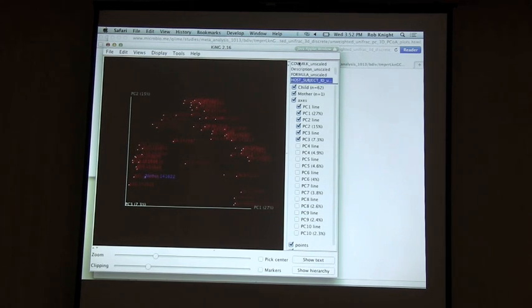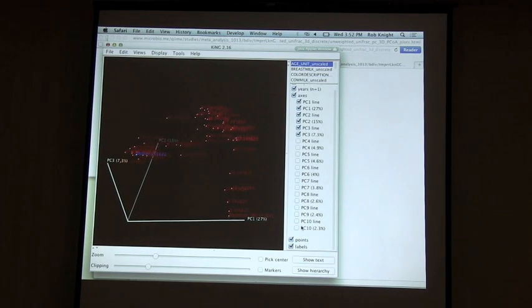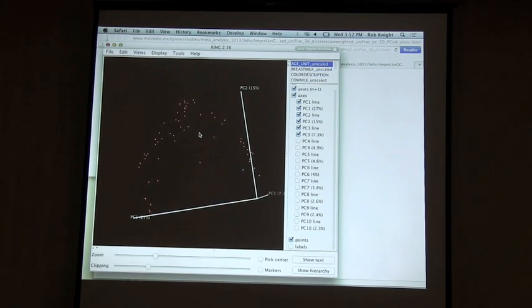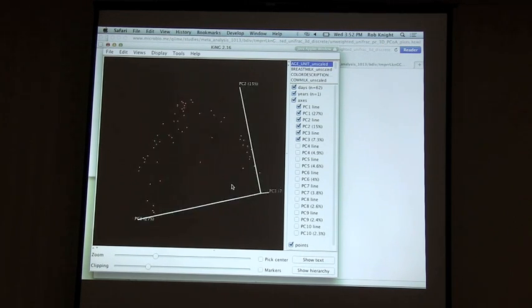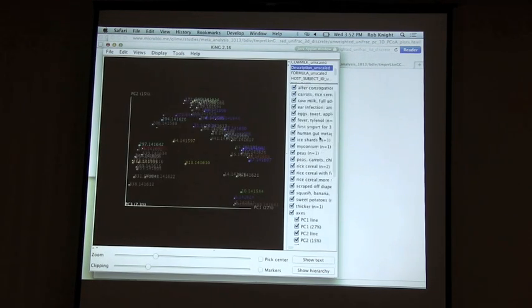Yeah, so basically what you can do is get very rapidly to the kinds of analyses that you're used to seeing in QIIME. For example, here what we're looking at is the mother sample, and looking at how the community is arched over to match that. What did I do wrong here?